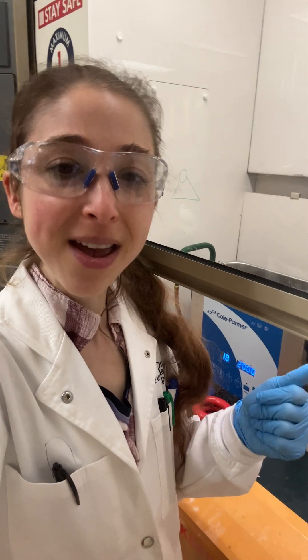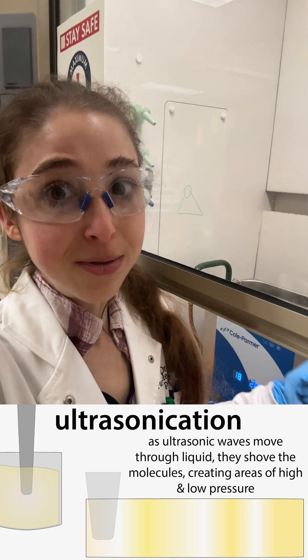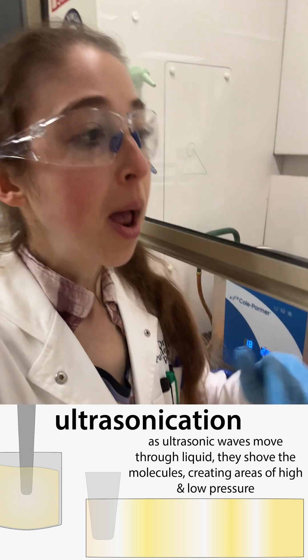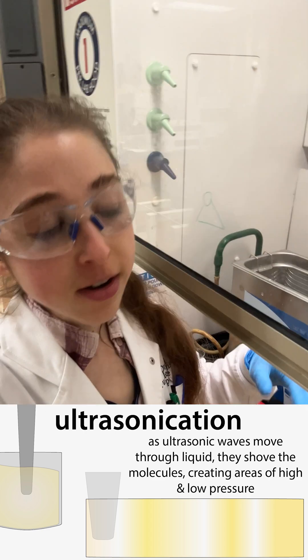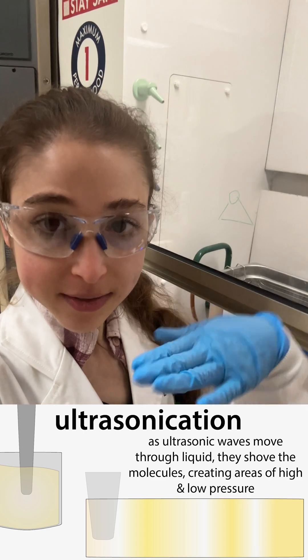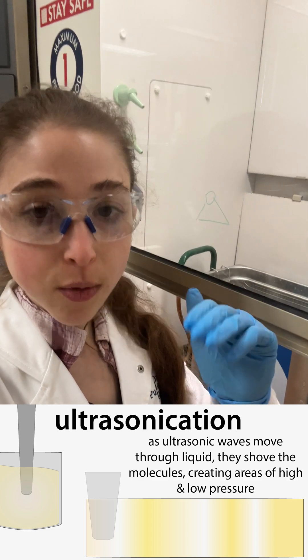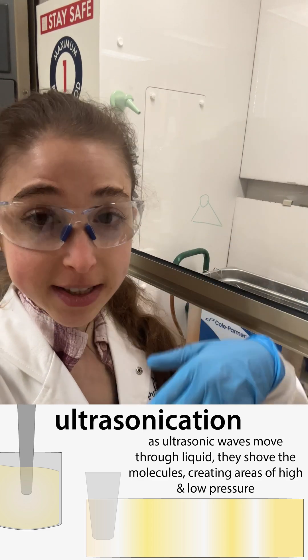The more solute-solvent interactions you can allow, the better. Sonication does this by using ultrasonic waves. In a bath sonicator, it sends out these waves that travel through the liquid, giving you areas of high pressure and areas of low pressure.